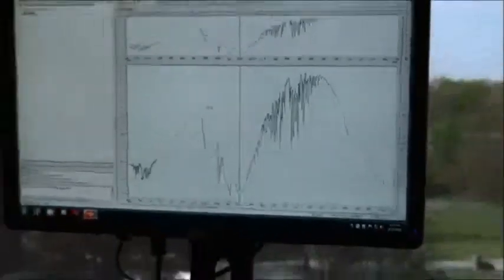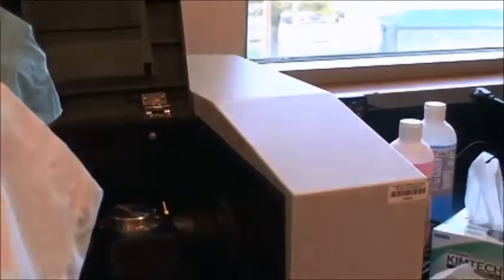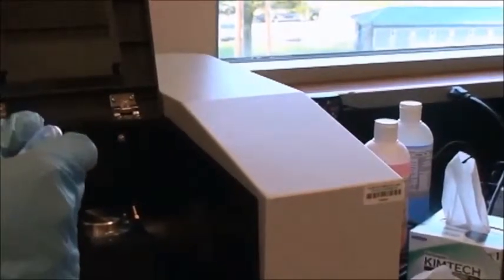So if you have a liquid sample, we have methanol here. And if you just place, it only takes a drop. That's the good thing about FTIR machines. They don't take a lot.